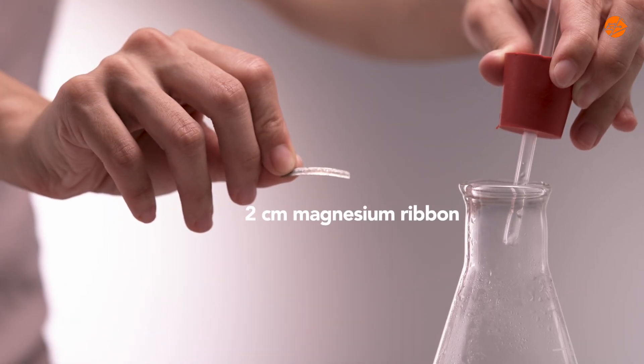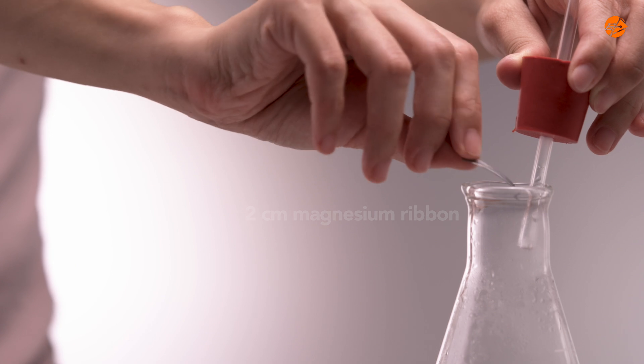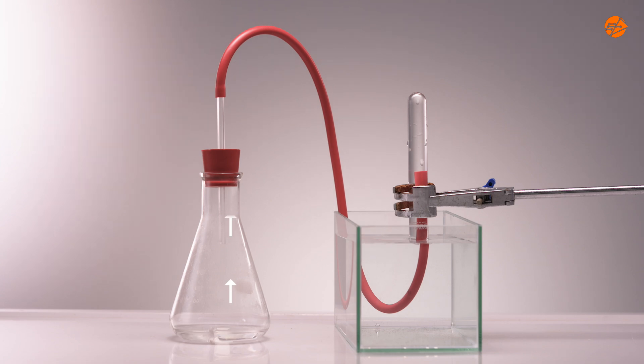Add a 2 cm magnesium ribbon into the acid and quickly insert the bung into the conical flask. The reaction starts and the gas travels through the delivery tube towards the test tube in the water trough, where it displaces the water.